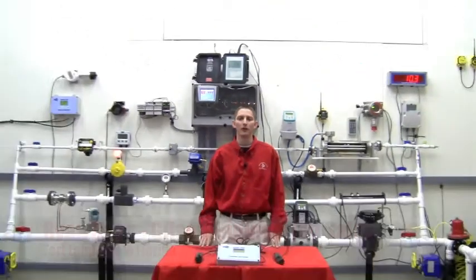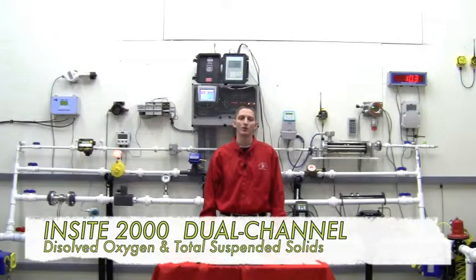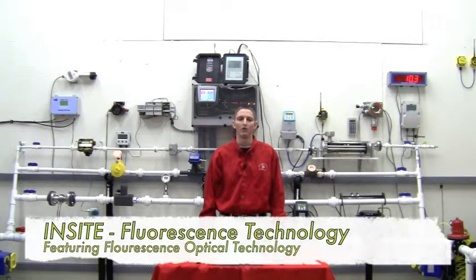Hi, I'm Ryan Dean with Gilson Engineering Sales of Florida in the Fort Lauderdale office. Today I'm here in the Gilson Engineering Flow Lab to talk to you about the Insight line of dissolved oxygen and total suspended solids monitors that feature a fluorescence optical technology.